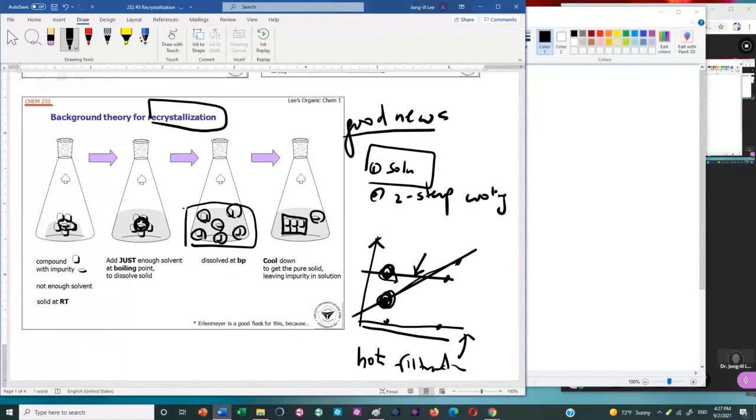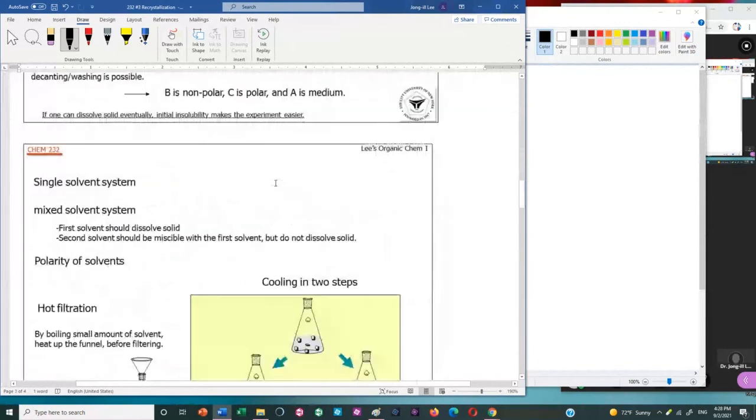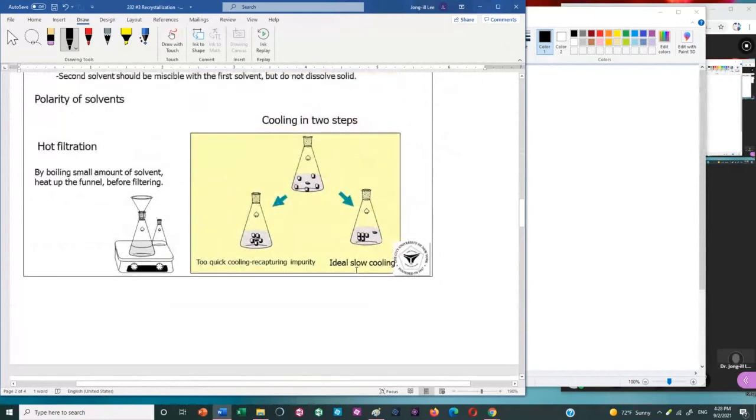Next moment is this. Bring just them, not impurity. Why not? Why wouldn't impurity interact with another molecule? There must be a reason for it. Okay? So two-step cooling. That's why that MIT video was so careful in losing the heat slowly. Okay? Slowly. Two-step cooling. Slowly.